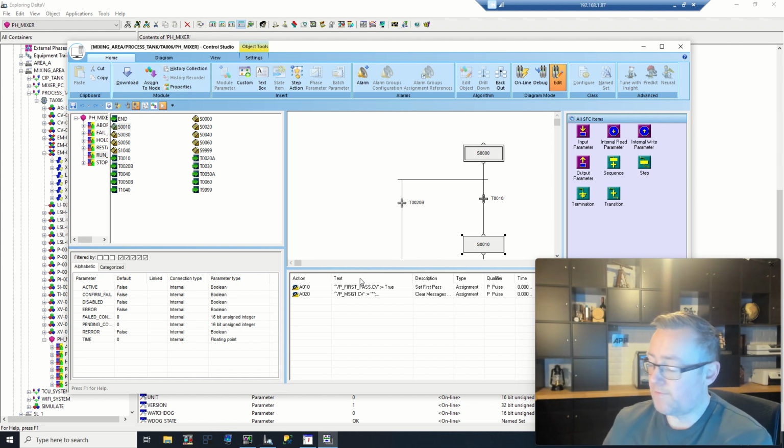Okay, so I'll follow this up with some videos on that application specifically, and I'll focus in on, for example, the sequencing, how to deal with defects, how attachments are digitally structured, and the back end of the application as well. Thank you very much.